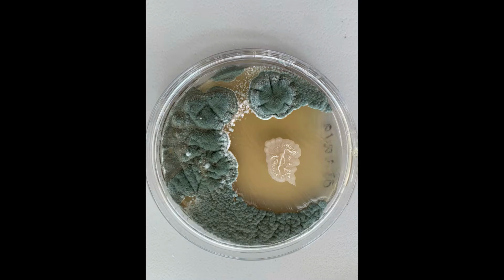In this case you can see the mold is growing around, forming a clear area of the agar in these areas here, and the yeast is growing with this type of shape in the middle. So it's definitely producing an antimicrobial agent, in this case antifungal.